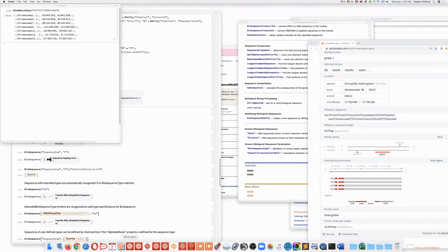And right now we are getting rid of that. Not necessarily. Okay, fine. But if it does, we should preserve that when we get the biosequence out. Right now, if I just take a random FASTA file, if I pull in my genome, which is stored as FASTA files, I literally drag it into this notebook, it will come out as the default element.